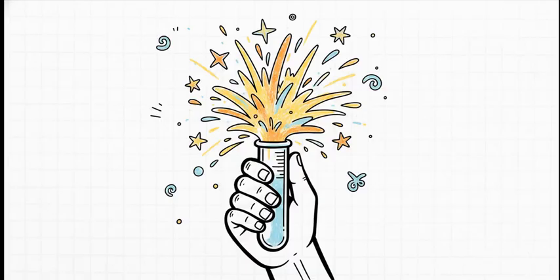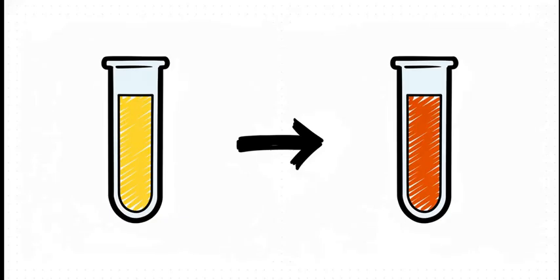And that brings us to phase four, reading the results. This is the payoff, the exact moment where all that invisible chemistry turns into a stunning visual reveal right before our very eyes. This brilliantly illustrates how color is the absolute main character of this scientific story. Let's break it down. When we first added the concentrated nitric acid to the aromatic amino acids and heated it, they reacted to form these yellow nitro derivatives. That is stage one. You see the formation of a clear, bright yellow color, which hints that our target molecules just might be in there.